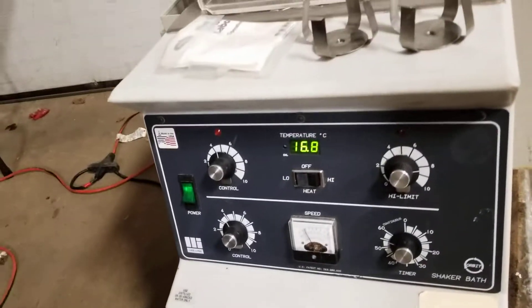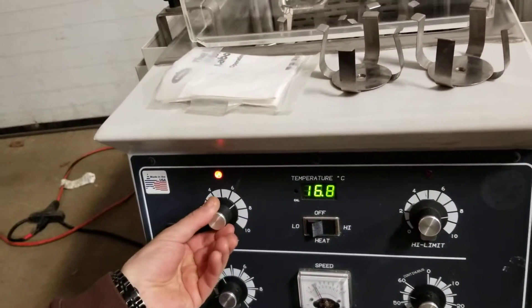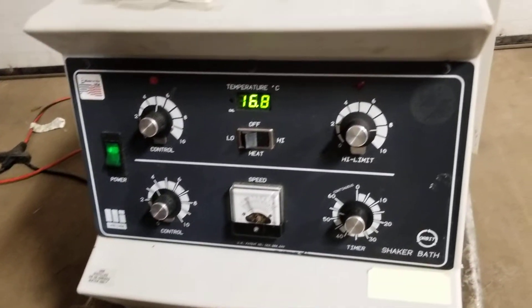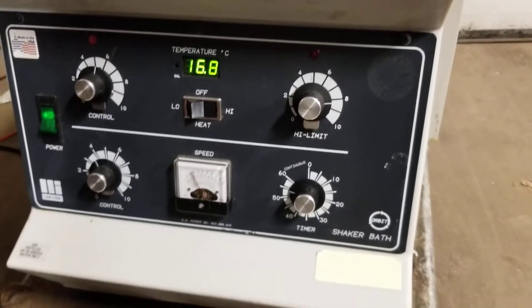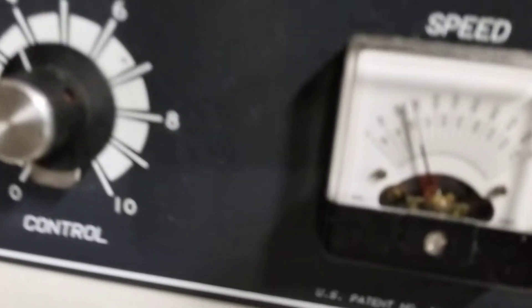What else does it do here? The heat goes on and off, and high and low. High limit, timer — and that's the speed.